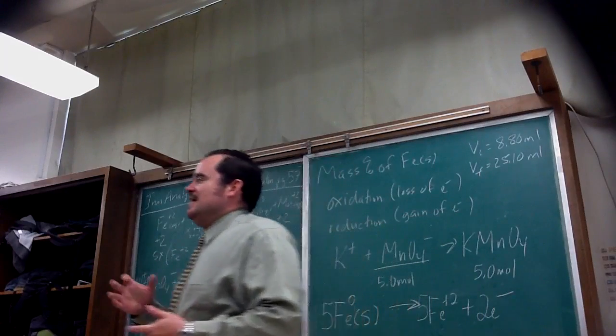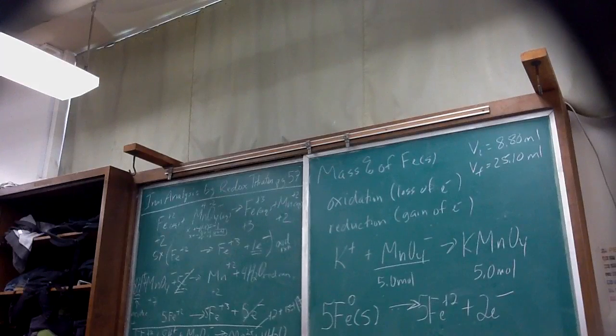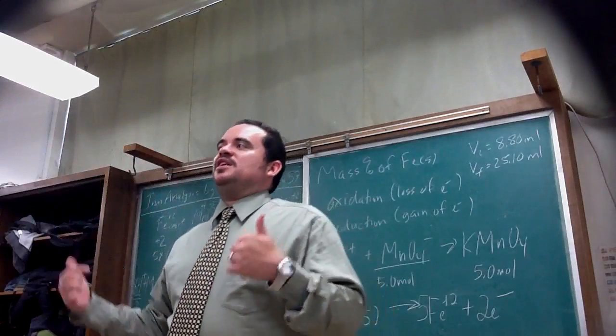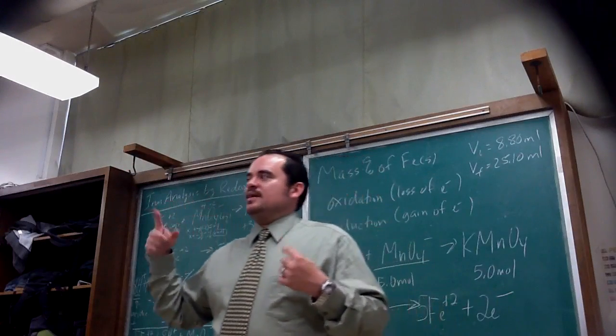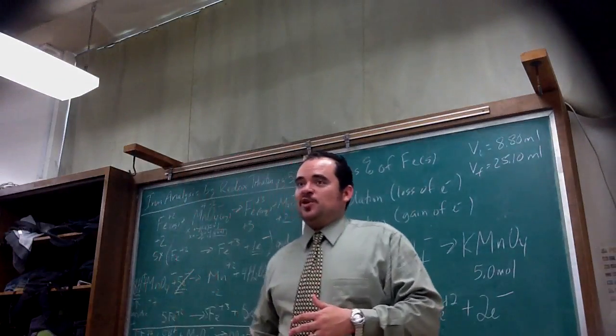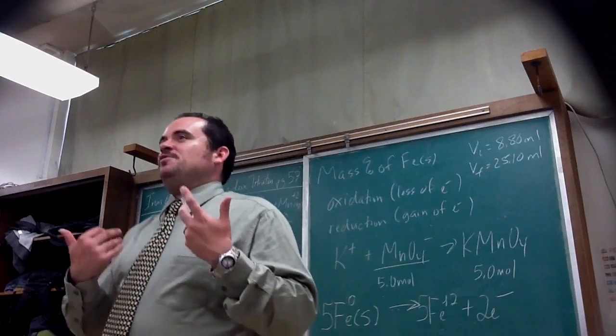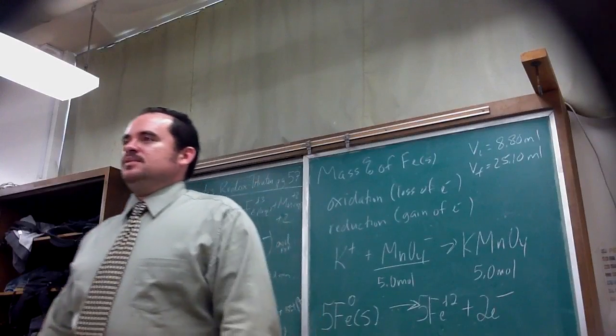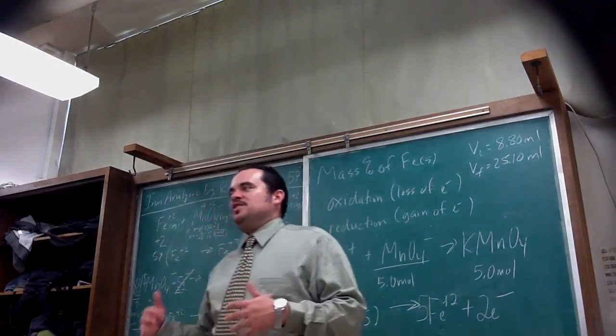Sulfuric acid. It is 1 molar concentration. So this is also considered a corrosive, and it can eat through stuff, like paper and whatnot. Clothing, if you get it on your clothing, as the water starts to evaporate, the concentration does what? It increases. It's not the other way around where it decreases because you dilute it. As the water evaporates on your clothing, the concentration goes up. Therefore, even if you wash them and whatnot, the next time around when you look at your clothes, it's going to have a hole. And you will find it. So be very careful not to get sulfuric acid on your clothing.